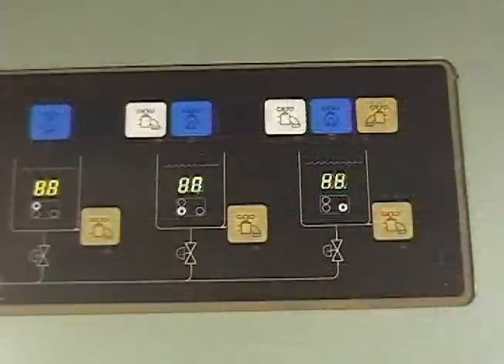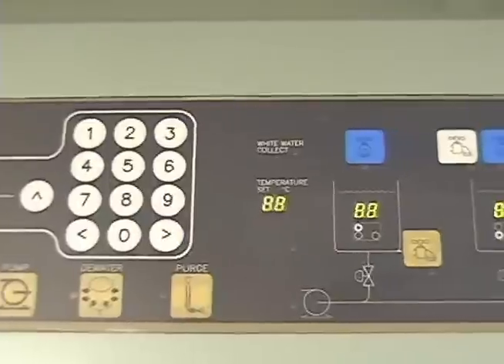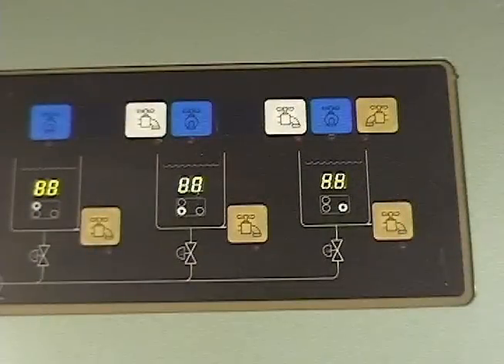The second menu is used to turn the recirculation pumps on and off. There are other menus which can be used for more detailed setup of the machine. Manual controls are used to initiate actions outside of the automatic paper making cycle. All manual controls are toggle type switches which will remain activated until pressed again for deactivation. The upper buttons control the valves for white water, fresh water, and stock introduction. The lower button drains the tank.